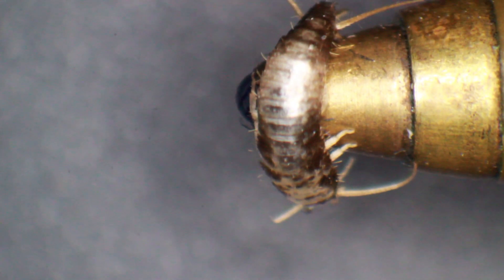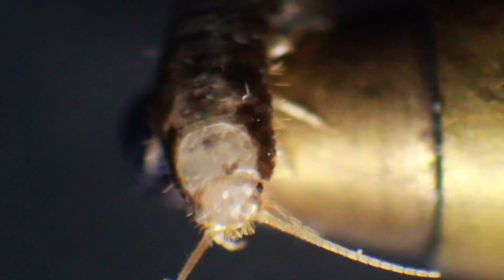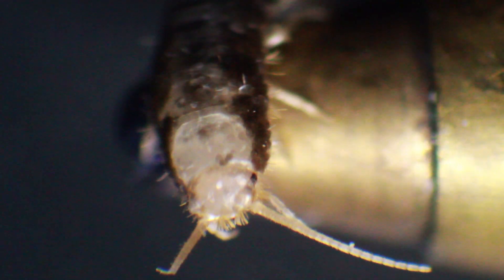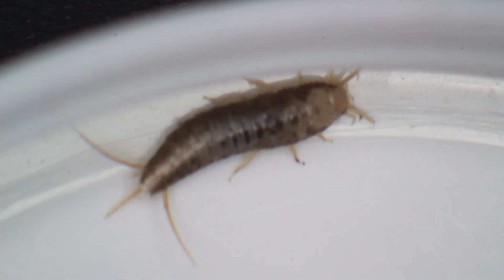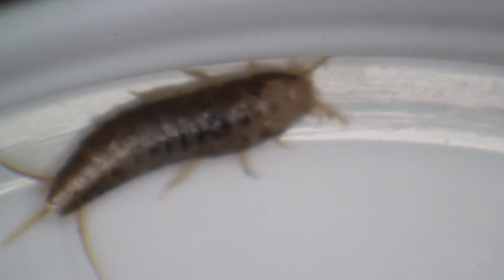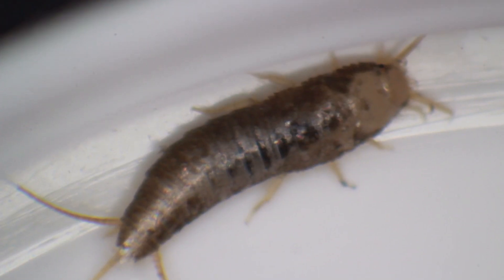I'm now using the lowest magnification, and here zoomed in a little bit more. You can see there are two tiny compound eyes - they look kind of cute. This is a view from the top again, and then there was something that really confused me a little bit.